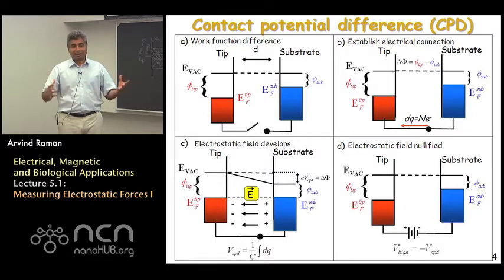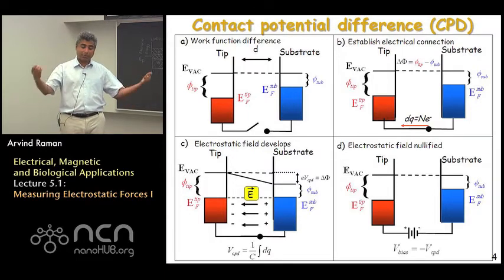And this is, in basic physics, regarded as the main reason why electrons don't just fall out of conducting surfaces, because there's an energy barrier, which is basically the work function, that has to be overcome for the electrons to be pulled out of the bulk solid and pulled out into space.